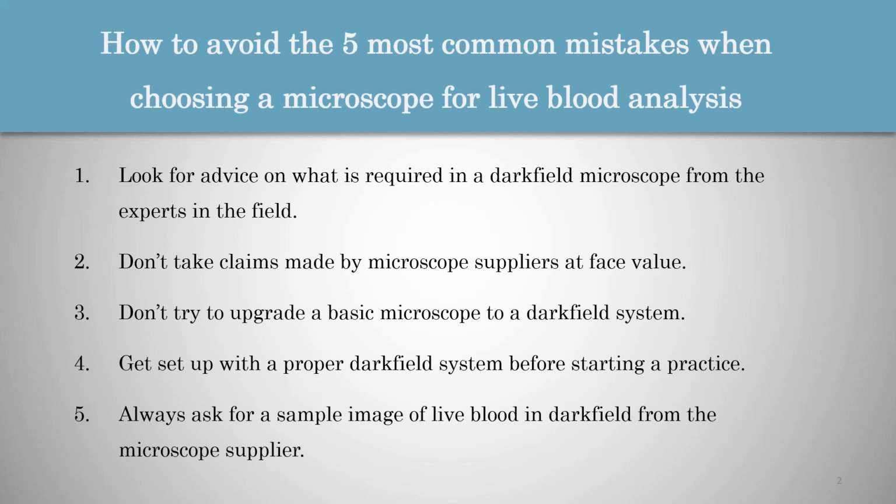So there really is no simple way to upgrade it. Perhaps if you have some electrical engineering knowledge and you're able to build something, then you may be able to source the components and actually put it together. But it is quite a specialized system. Our dark field systems use a 9-watt LED light source that produces a brightness equivalent to 100-watt halogen. So really quite bright, and quite a specialized system.